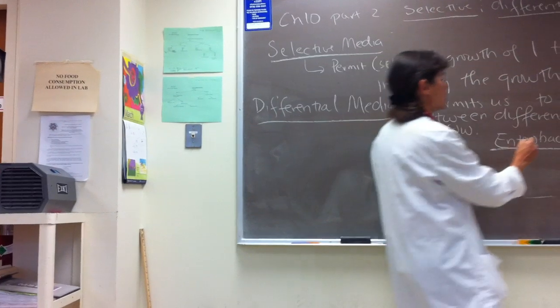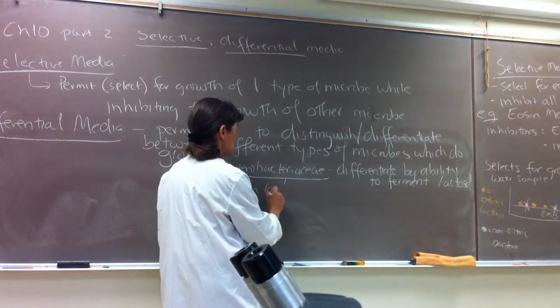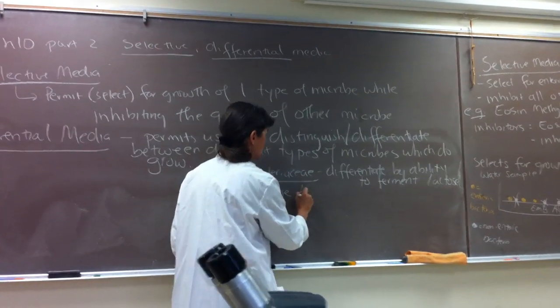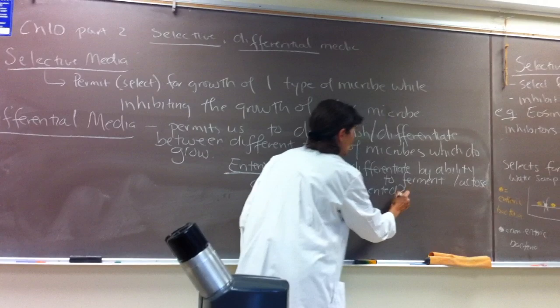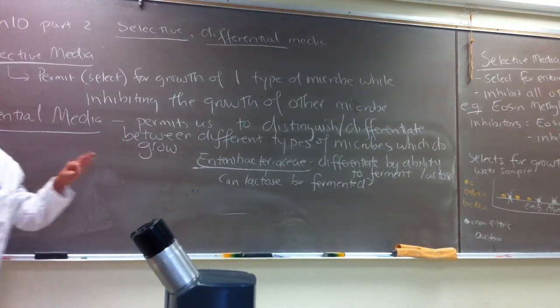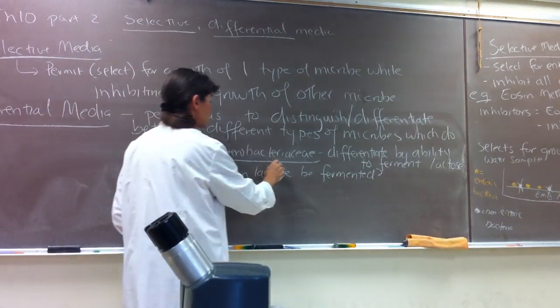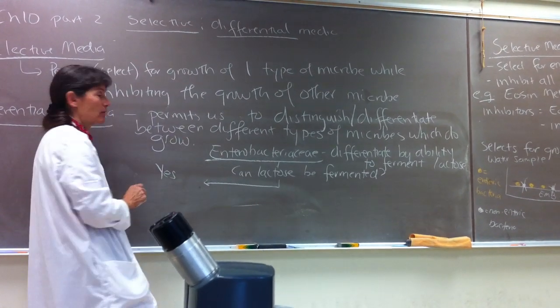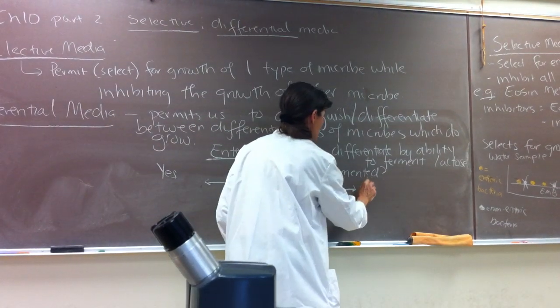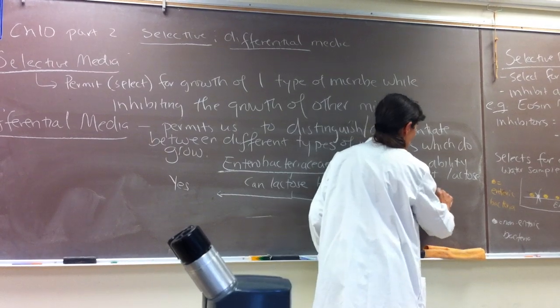Okay, so the big question we're going to ask here is, can lactose be fermented? That's the question we're using to differentiate between all the different groups of Enterobacteriaceae. Okay, so we'll do a split here, and we'll say, over here, yes, lactose can be fermented. Over here, no lactose fermentation.